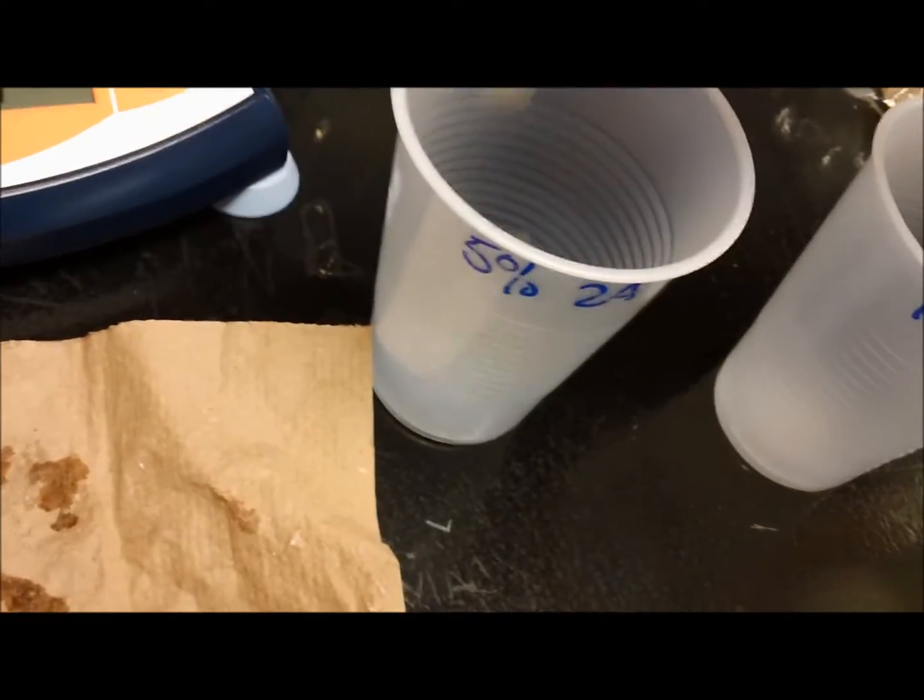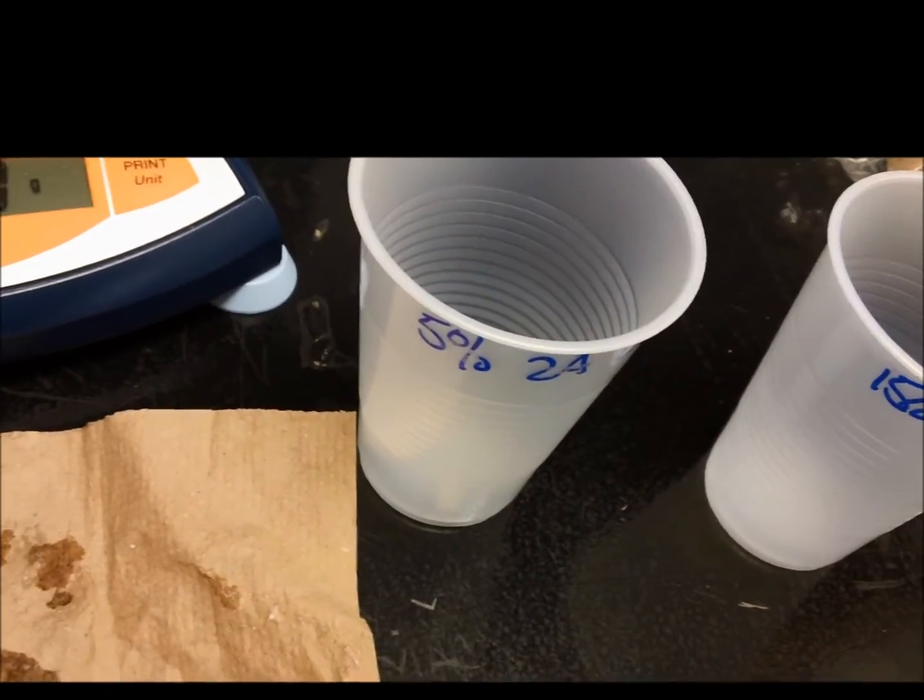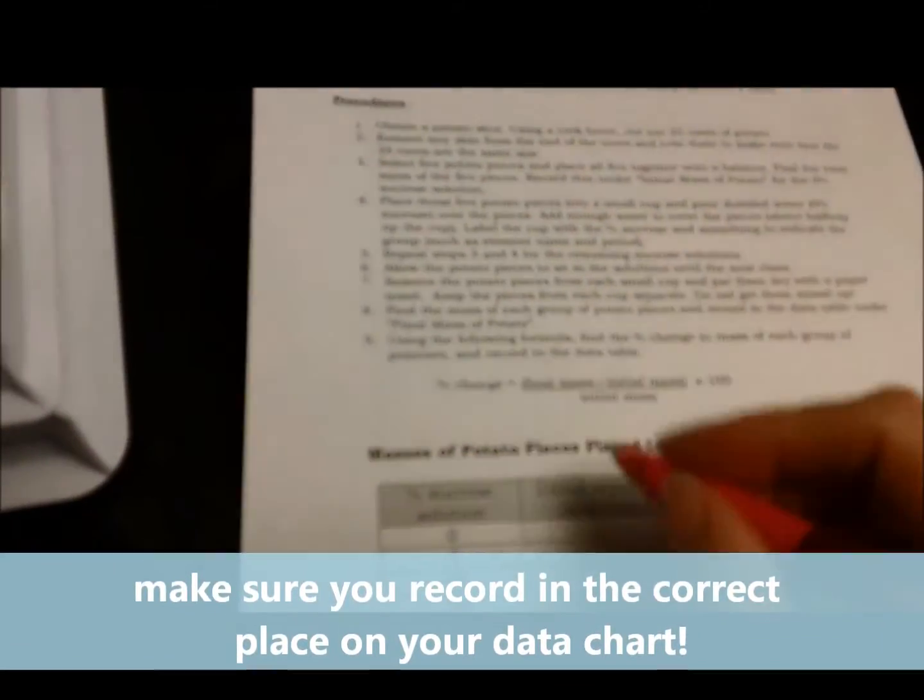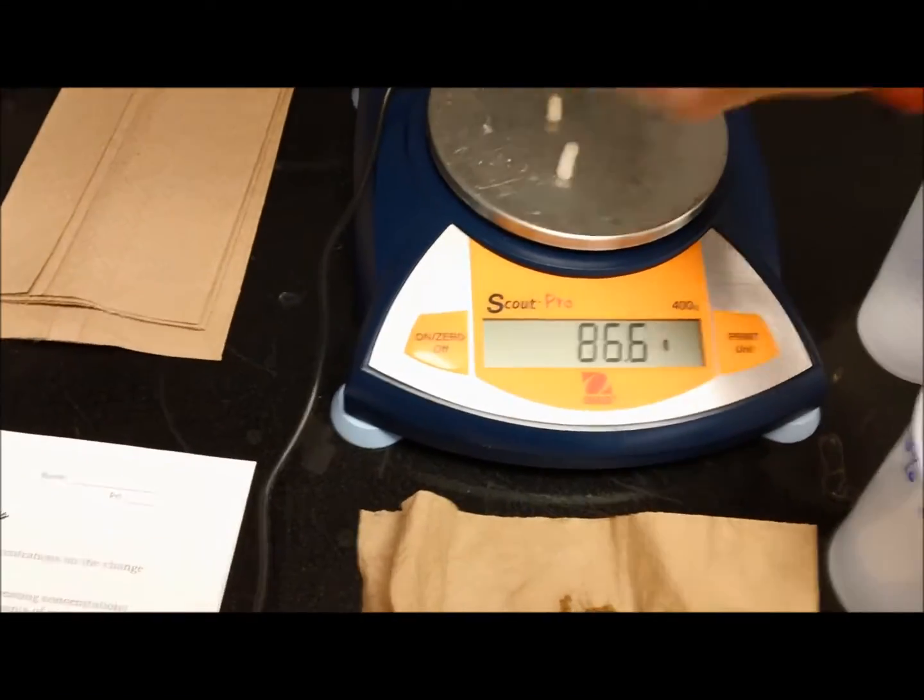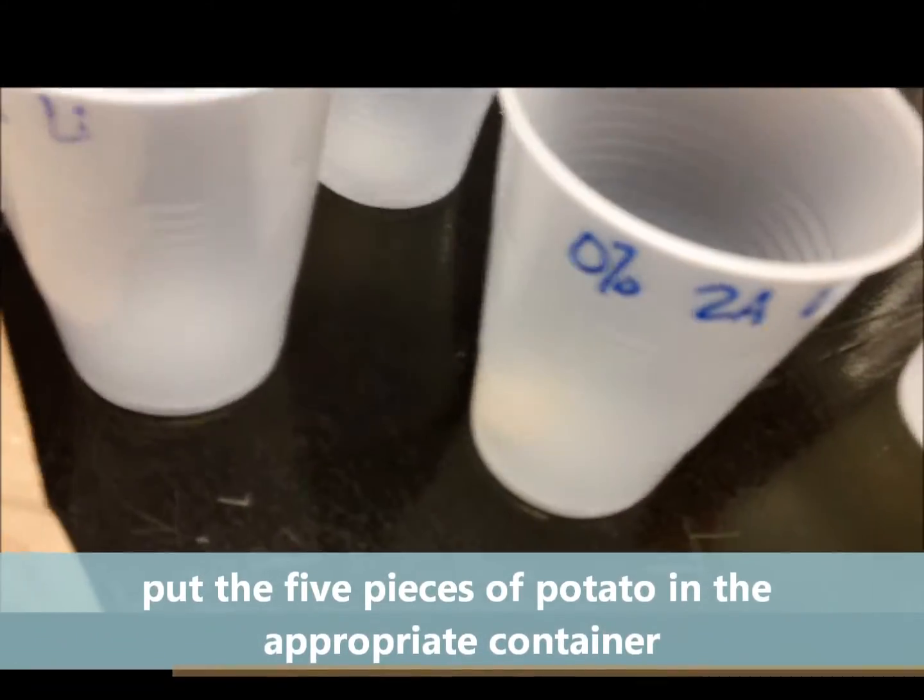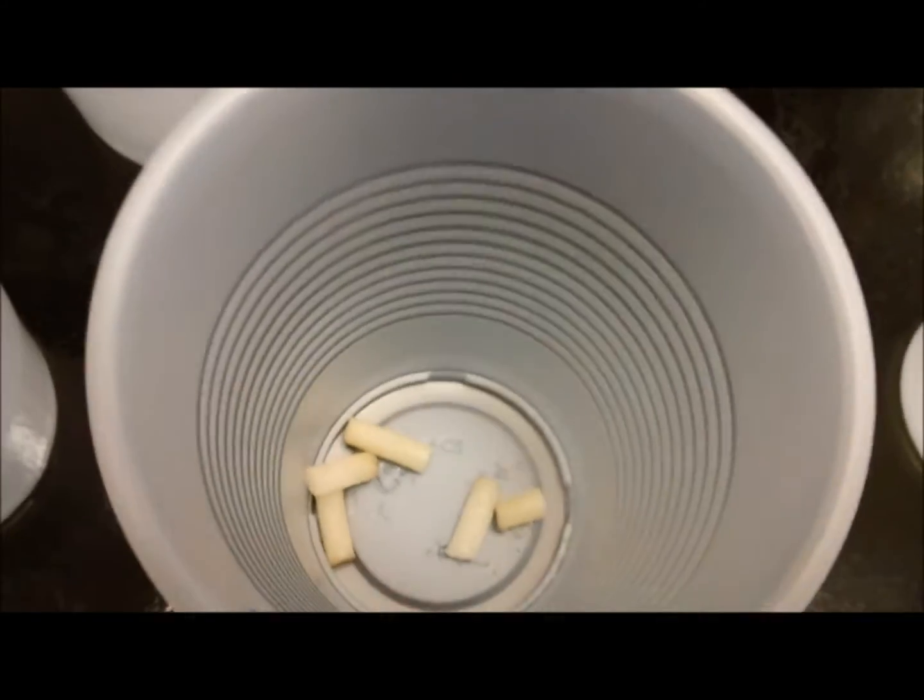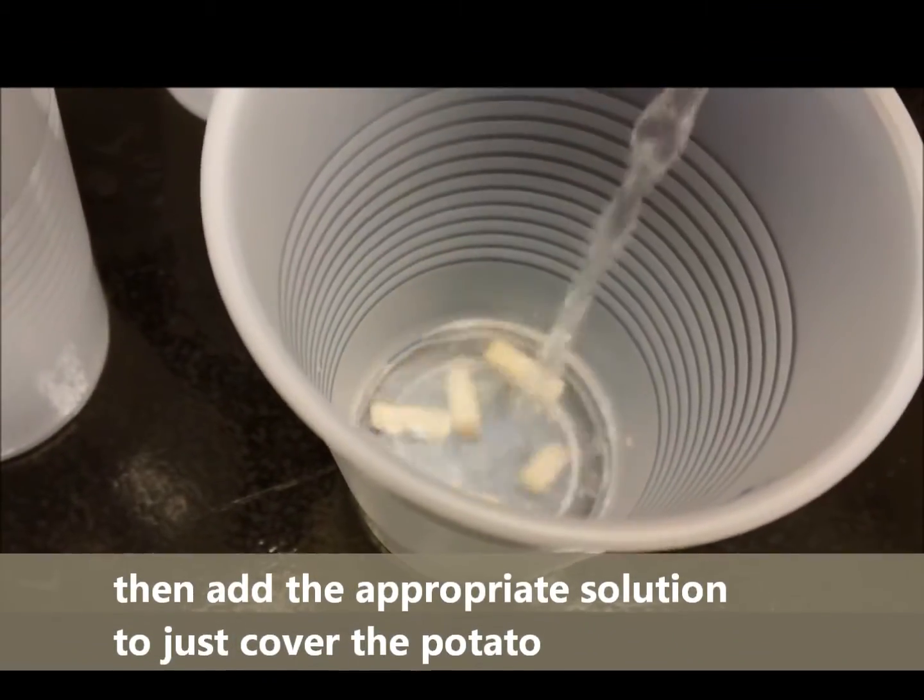Then you are done for this part of the lab. Let it reach equilibrium, then record your particular mass. Put the five pieces of potato in the appropriate labeled container, and then add the appropriate solution and pour until the potatoes are just barely covered.